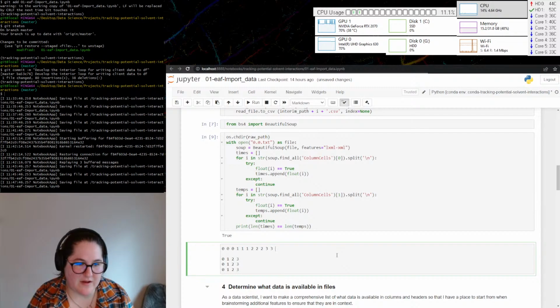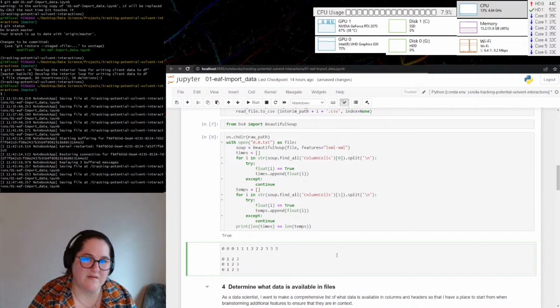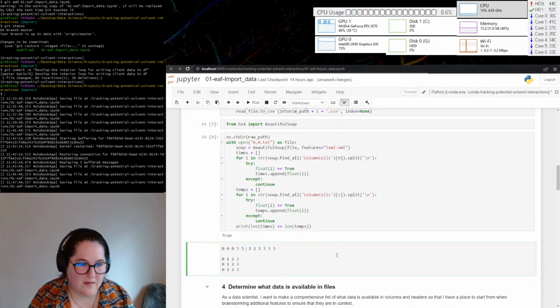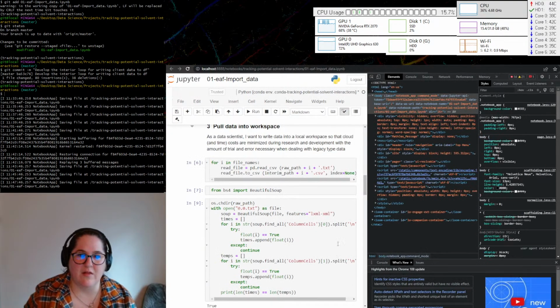I already know that I'm going to need to use like a multi-array type setup because I want to be able to do some statistical analysis on all of the trials that were 0 concentration, all of the trials that were, I think it's 5. I should make this more accurate. 5 and then 10.